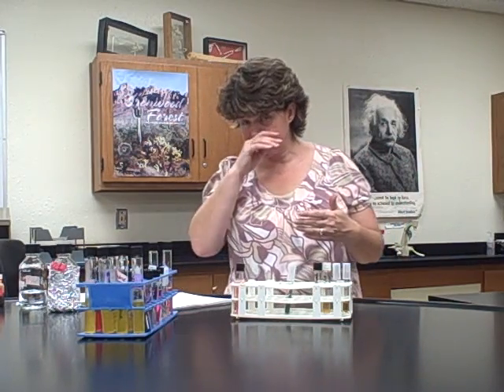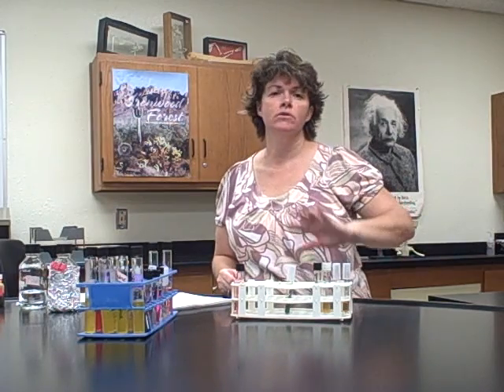Now this is where I had assigned you a particular bacteria that I wanted you to do. One group did E. coli, one group did Enterobacter, another group did Pseudomonas, and a third group did Proteus vulgaris. So what you'll have to do is share your results. What I'd like for you to do is look on page 97.